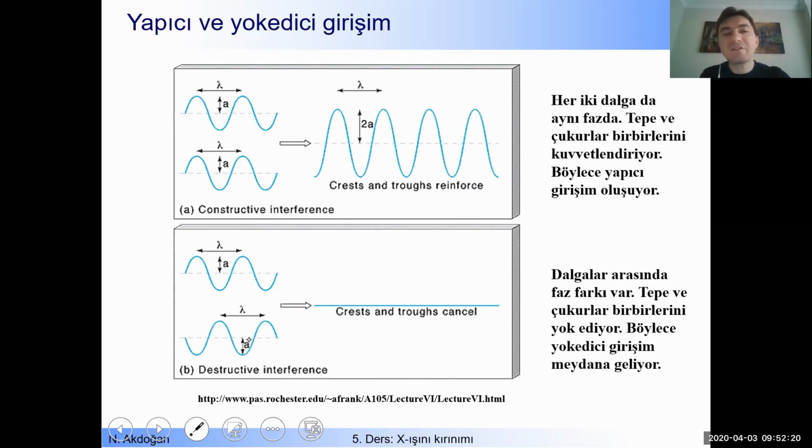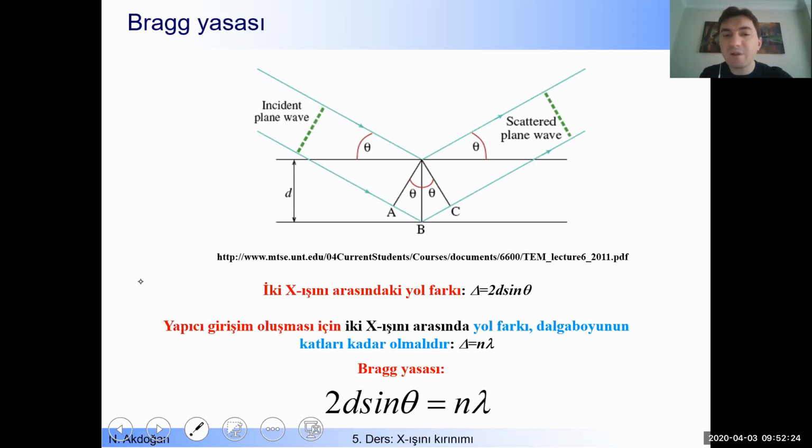So now let's try to use that information and explain the X-ray diffraction formula developed by Bragg. And don't forget that this work was awarded the Nobel Prize in Physics in 1915. So here we have another schematic representation of the crystal and incoming and scattered X-rays. This is one atomic plane.